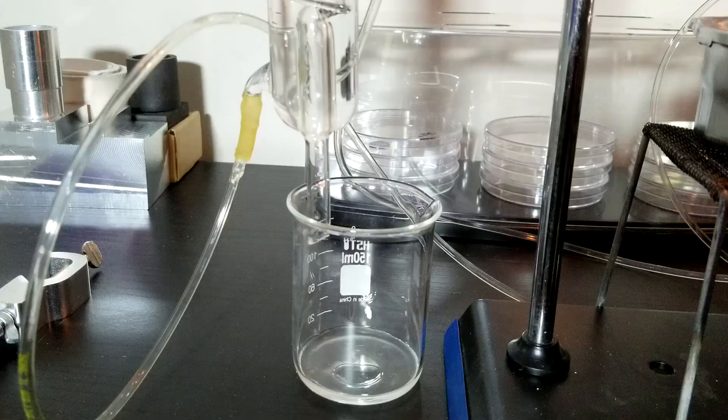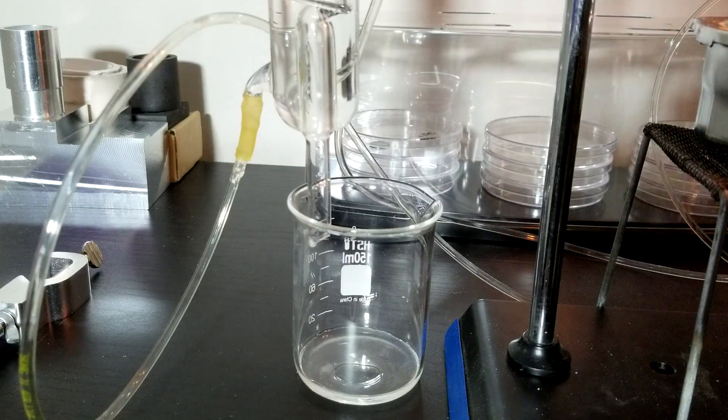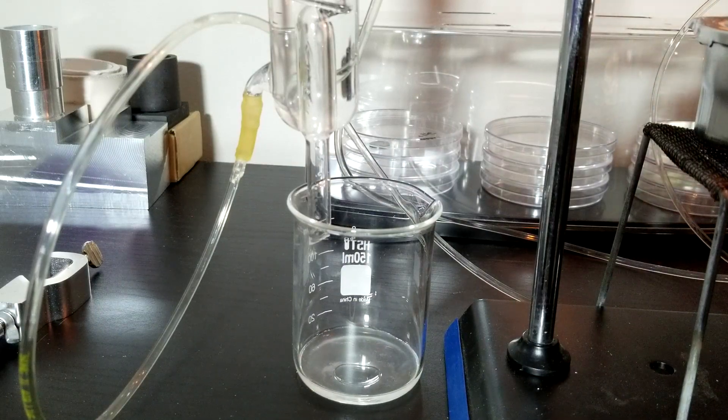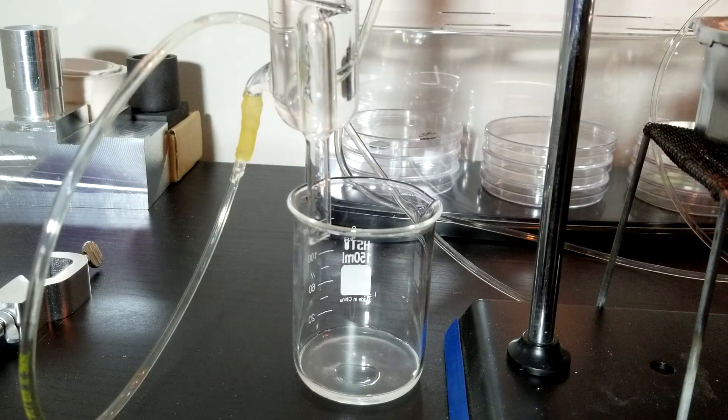At the bottom of the condenser, there is a beaker collecting the oil. Note that the product is slightly cloudy and you can see the separation layer due to the oil.